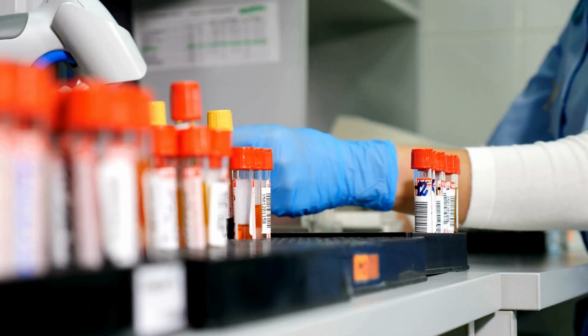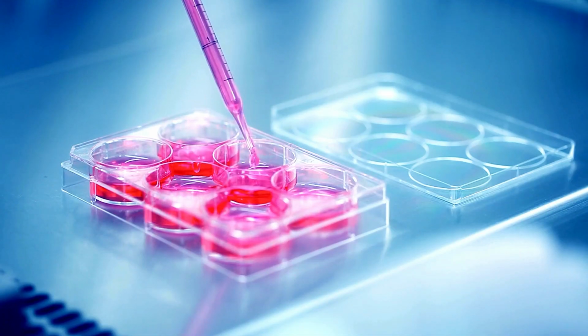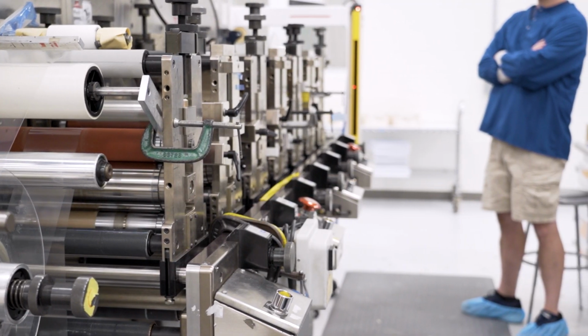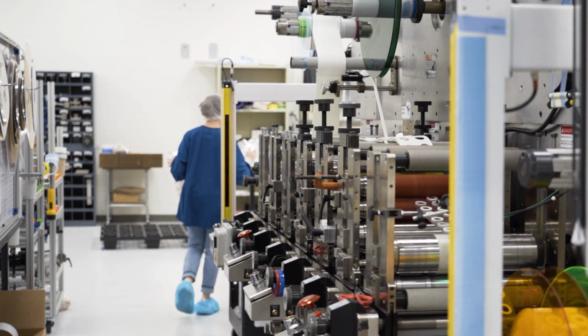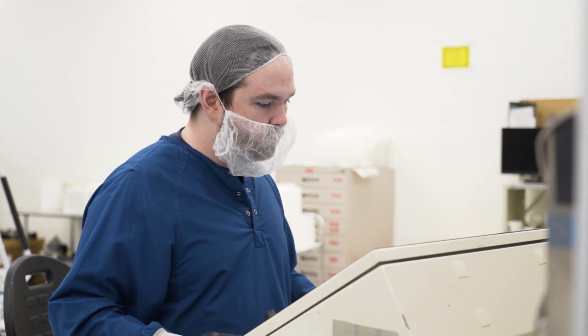For instance, if the device will be used in a clinical diagnostic setting, the material must support that functionality without compromising accuracy or safety. Other key considerations include the material's durability and overall cost. Beyond that, the environment in which you manufacture, such as a clean room for diagnostic applications, can also influence your choice. Every device design has unique demands, and aligning those with material properties ensures both performance and manufacturability.